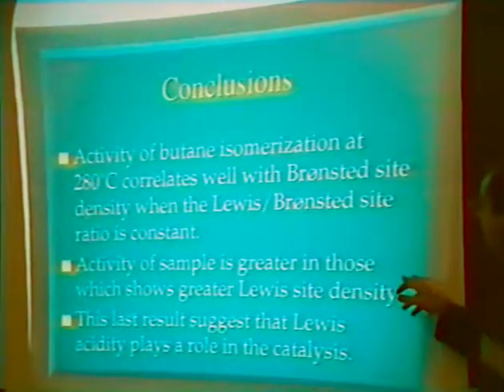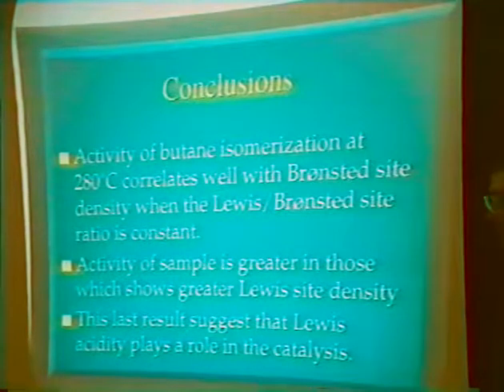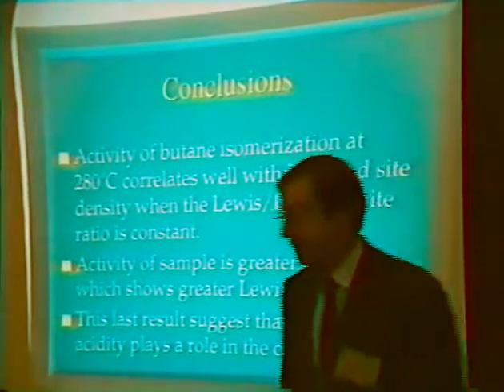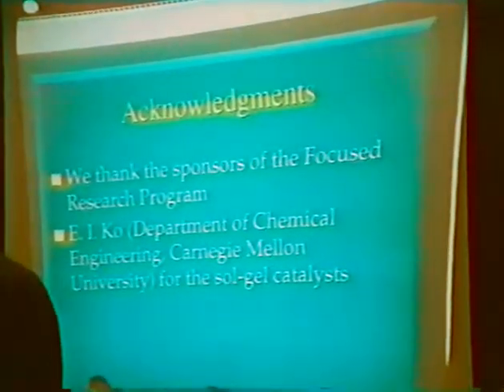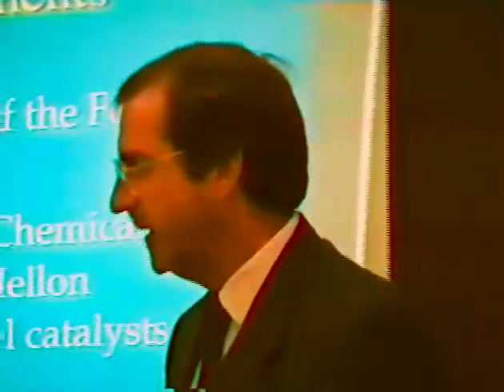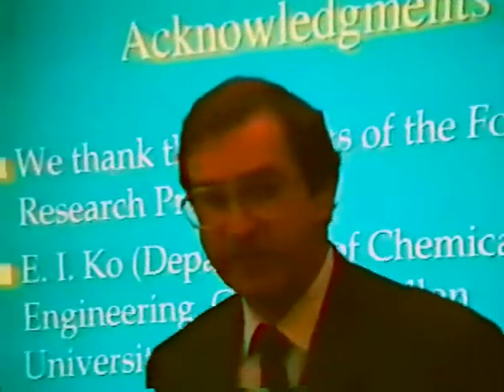The activity of one sample apparently is greater, which has a greater Lewis site population. And this result suggests that Lewis acidity plays a role in catalysis, which I guess everyone else has talked about today in some way. We thank those people that have helped us make this possible. Also thank Ed for giving us some samples, and also David Clough for giving us samples from MEI. Thank you for your attention.